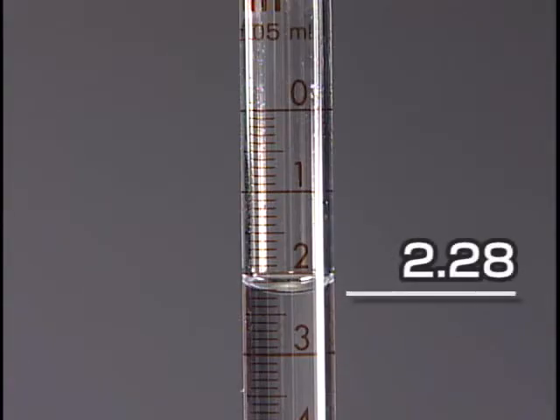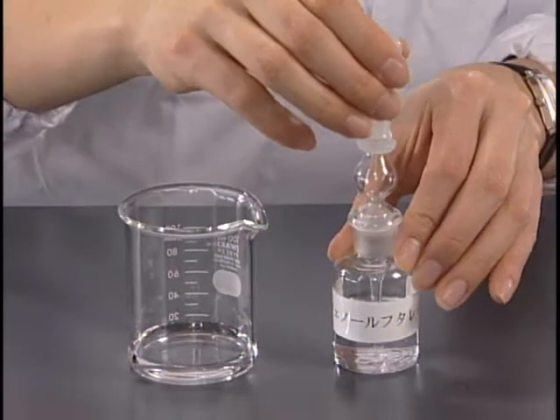There is no need to adjust the meniscus of the solution to zero. Move your eyes to the level of the liquid surface and read the value of the bottom of the meniscus with one tenth of the smallest scale marked on the burette.